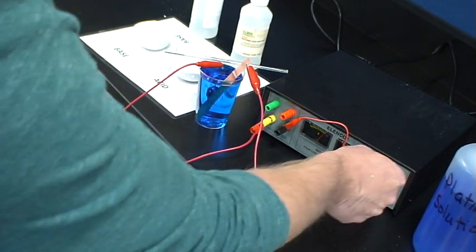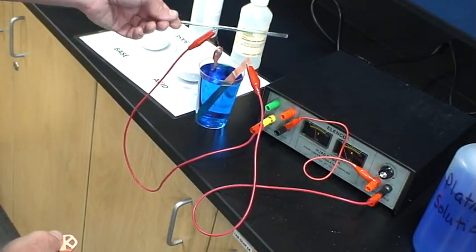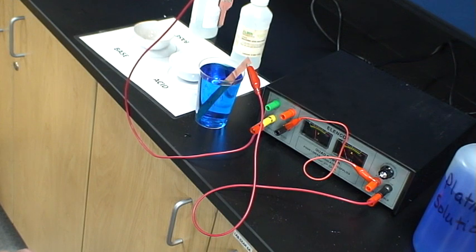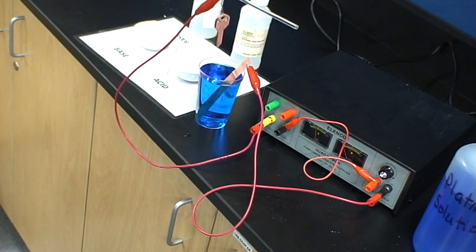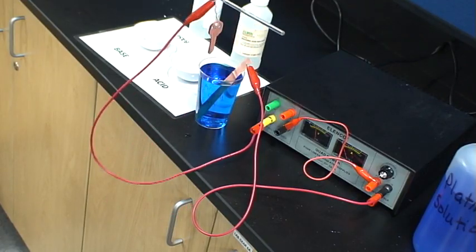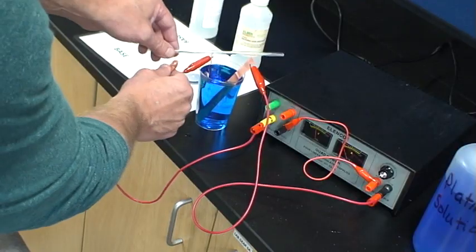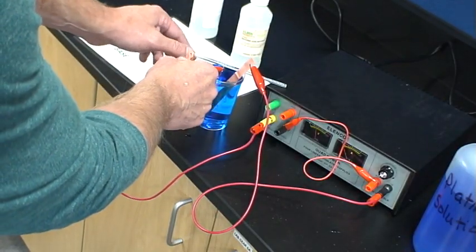You'll notice if I turn this off, even the short amount of time that I had with there, you see that, wow, there's a lot of copper that actually deposited on there. So it's a very quick procedure, but obviously the longer we would have that running, the more copper would be deposited. So that's the lab setup that we've got going on here.